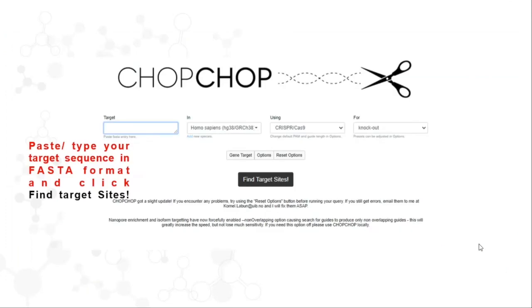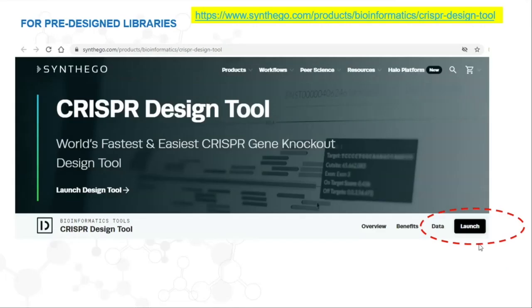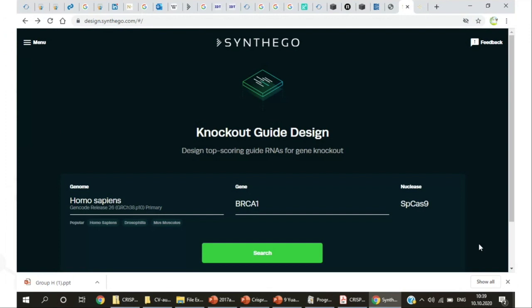Anything else? I give you 4 options, right? Yeah. So you have given me IDT, Sanjana Lab, Chop Chop, and the fourth one was GPP. Yes. And maybe you can also have this option of Synthego. Okay, great. So we have all the 5 options. In a moment, I'll just create that poll and we'll ask them.